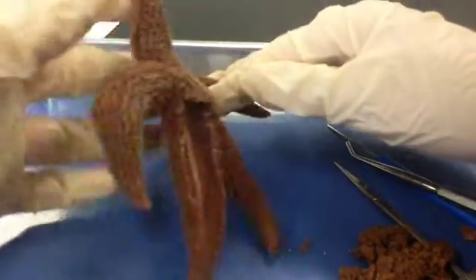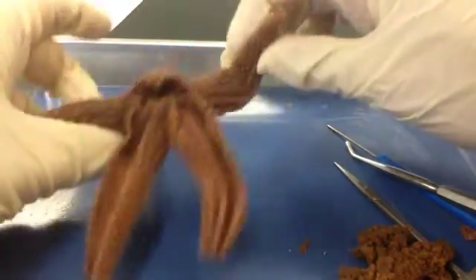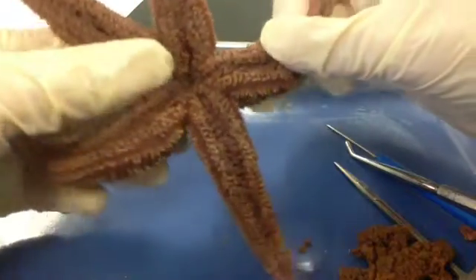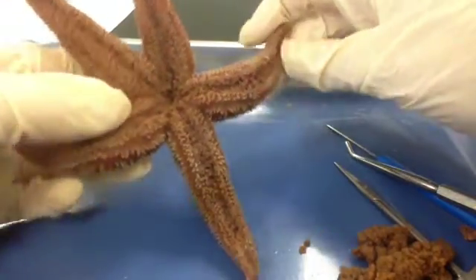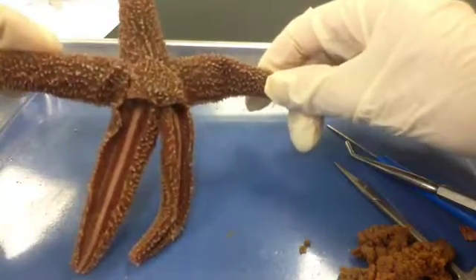If you are finished, make sure you've labeled everything necessary in your diagrams on your handouts. If you're doing the dissection along with me, make sure you clean up your materials. Thanks for hanging out with us.